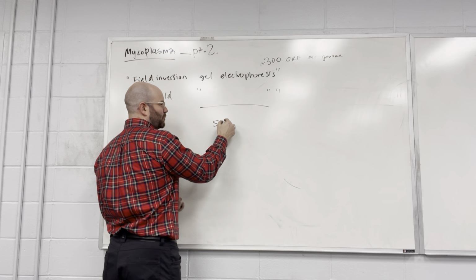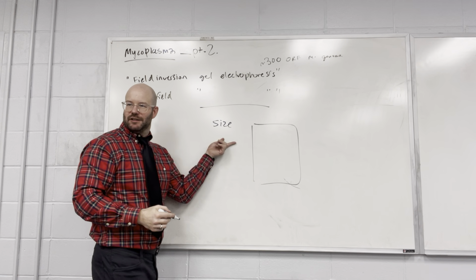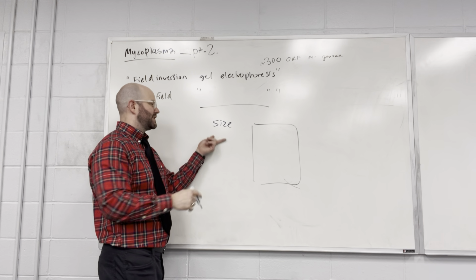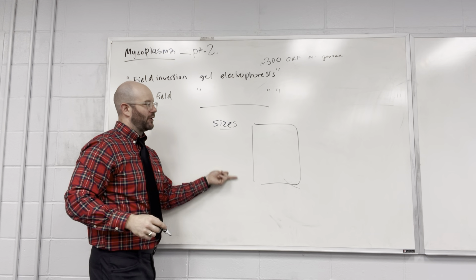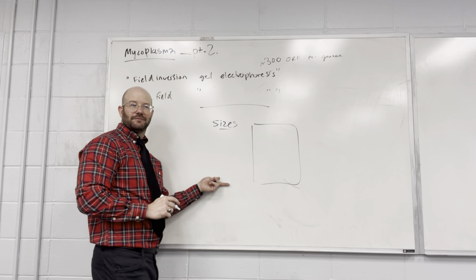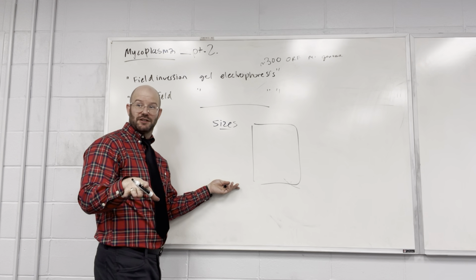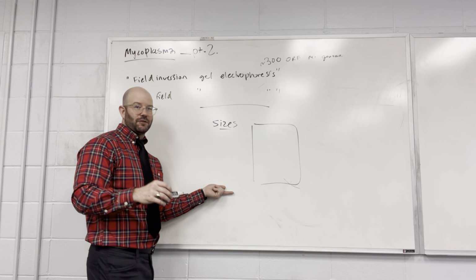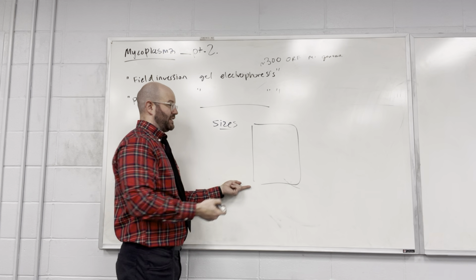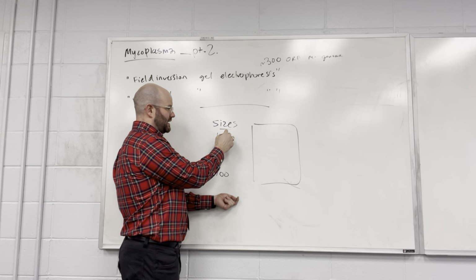So the size. When you run a normal agarose gel, what are the sizes of things you're dealing with? What are the sizes of things that you're typically running in a normal agarose gel? Do you remember the ladder size that we used? You're right, the limitation is the size of the things that they're making. This agarose gel only deals with small stuff. You can run things that are like 100 bp to probably 10 kb.